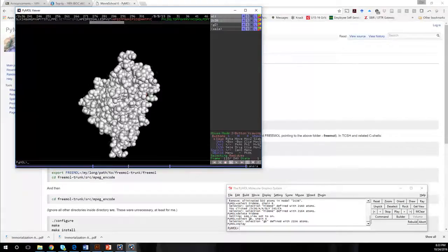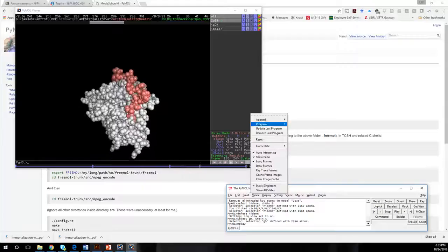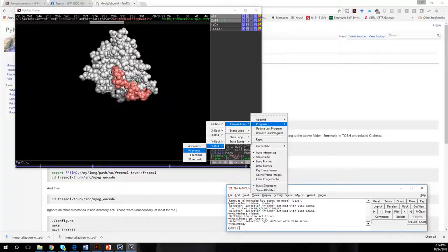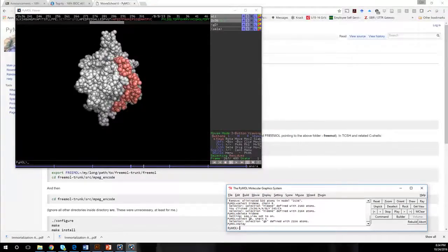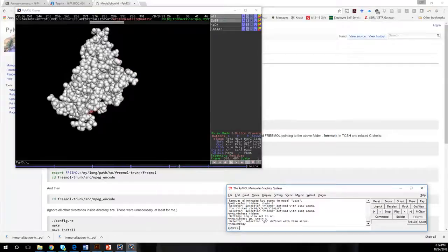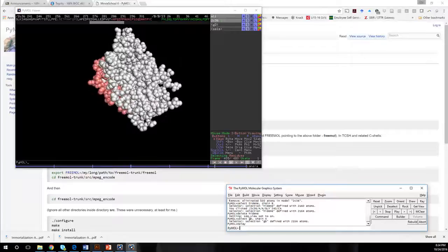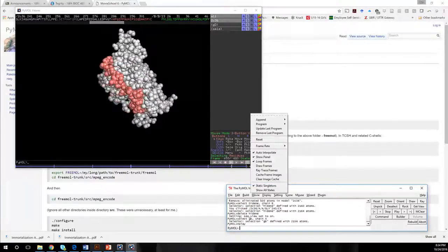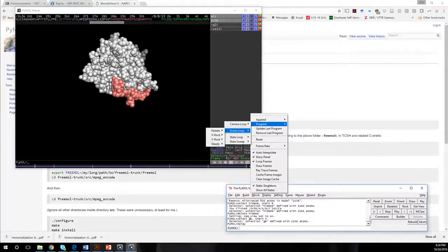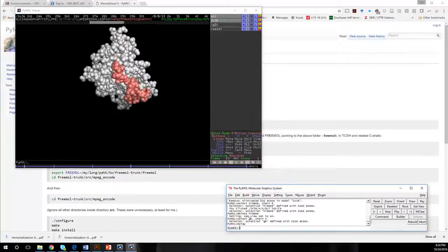And you notice down here it creates some scenes, and it's just going to go through those scenes. If I want to do a Y roll, I just go to program, camera loop, Y roll, 8 seconds, and it's going to shift it around that way. So then it's going to do the around the X-axis, then around the Y-axis. You can do the Z-axis. It makes it look like a propeller. But that's a command line. I don't know that they have any. Yeah, they don't have any Z-axis in there, so I just made a steady state one.